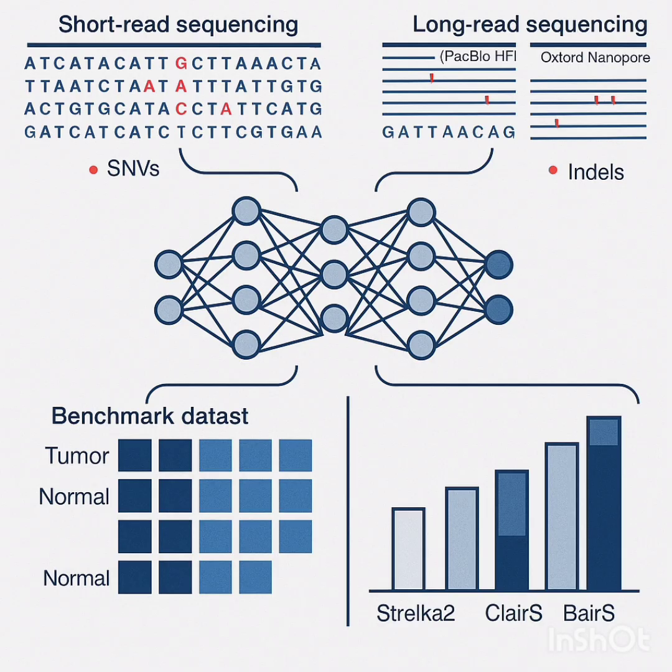Absolutely. For decades, people working on germline variants, the ones you inherit, have had tons of data, reference sets with millions of known variants to train their tools. Millions, okay. But for somatic variants in cancer, the field has just been starved for data. So historically, everyone was basically relying on just one main public benchmark set. That's pretty much it. The HCC1395, HCC1395BL set from SEQC2. And it only had tens of thousands of somatic variants. Tens of thousands versus millions, wow. Yeah, it's a huge gap.